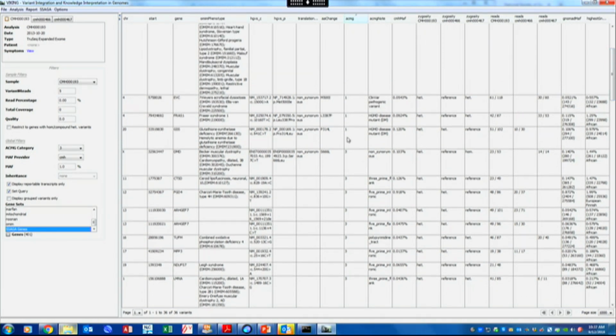You can see there's no category 2s, which means basically just loss of function variants that haven't been reported in the literature that match your phenotype filter that you have on, right? So I looked at this morning and I wasn't sure if our gene would match the phenotype filter at this point because it's a new gene. When we analyzed this case, it wasn't an OMIM-associated gene because we're the ones who discovered it.